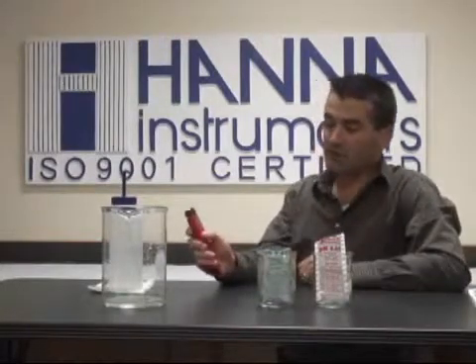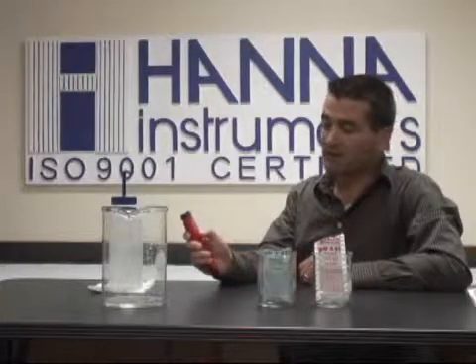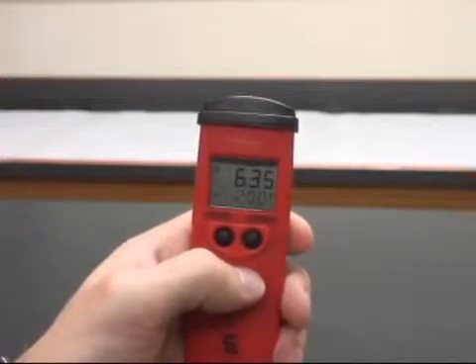Very simple — we're going to pull the cap off and we're going to turn the meter on. Once the meter has turned on completely and the LCD screen has loaded and is in the measurement mode, we'll begin, and it doesn't take too long as you can see.